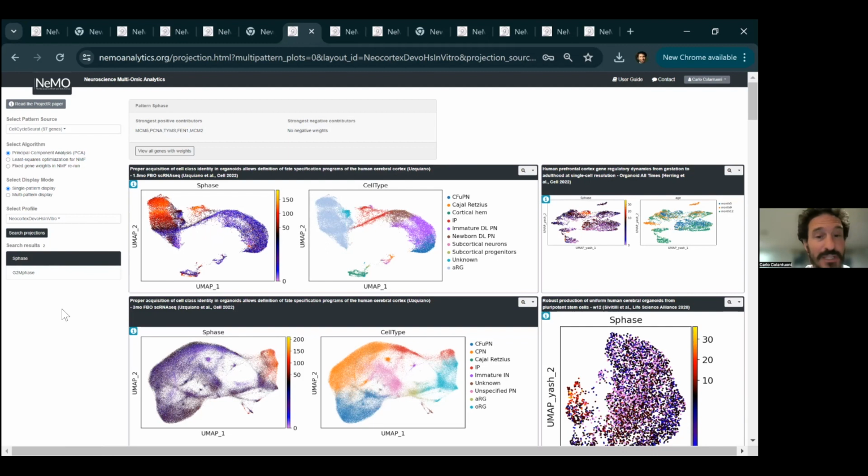So they can be a simple list of genes with no weights, just 5 favorite genes or 10 favorite genes associated with a condition, or they can be more complex things like a genome-wide principal component that has a weight for every gene in the genome.